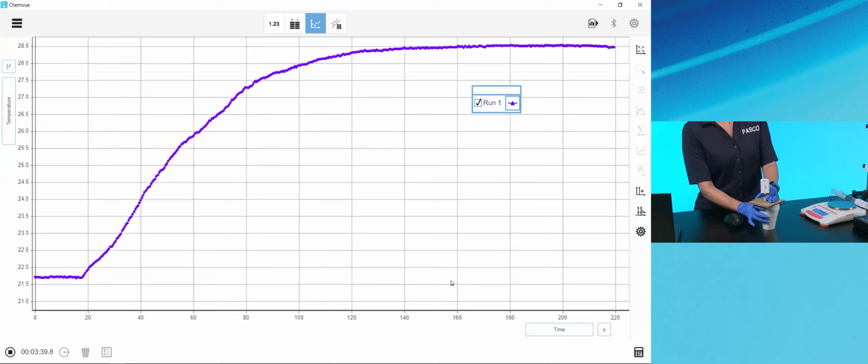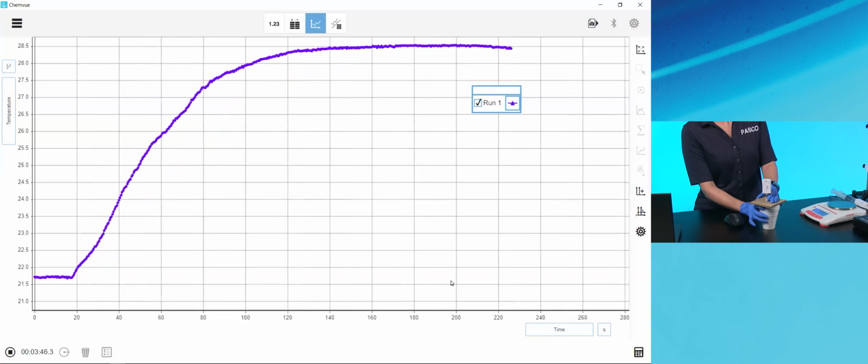And I can see that there's a definite decrease. So I would say, gosh, at least at 200 seconds, it looks like it began to decrease around 200 seconds. So I'm going to go to 260 seconds because that's important for the analysis. And I might even go farther than 260 because I want to be sure that I have captured the last, it's actually the last 30 seconds.